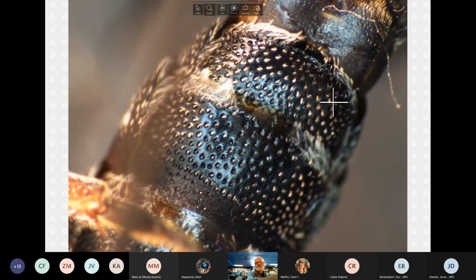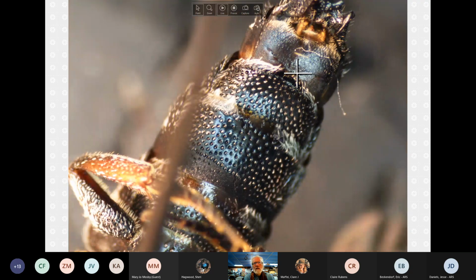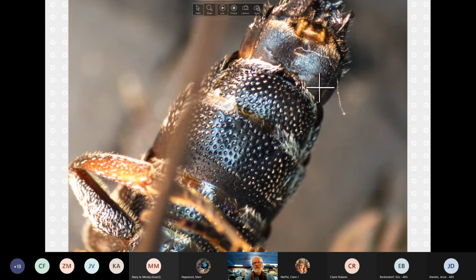Or am I looking at, okay, let me back off one second. Maybe it's not notched. I'd have to look at this more. And here you have, here's a translucent rim. It seems to be convex the whole way, as is the secondary one. So not greatly illuminating in terms of differences, but you'll see other ones that have a lot going on.